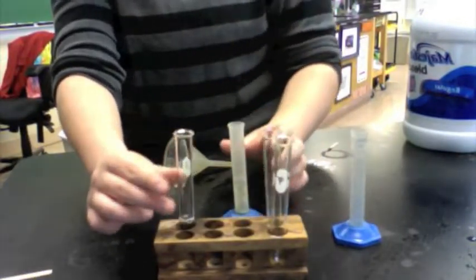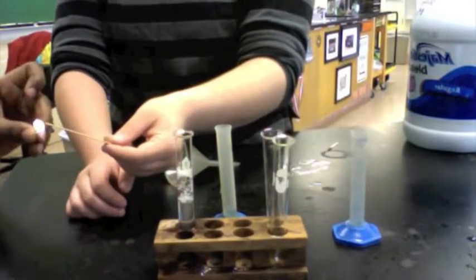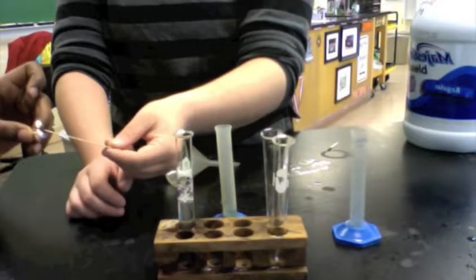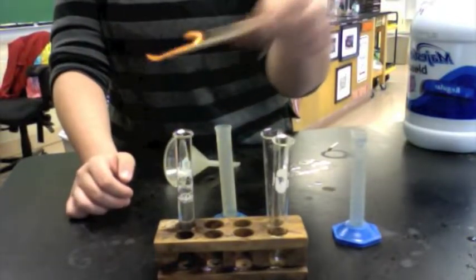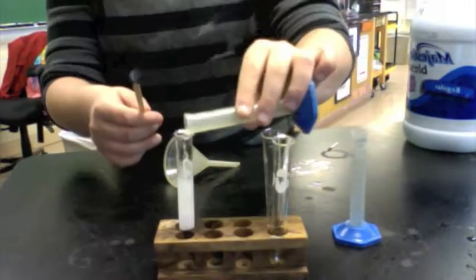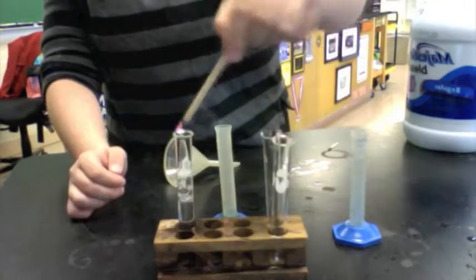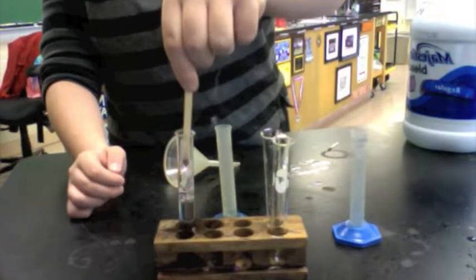Before you pour the bleach in, you will light the wooden splint. Once it's fully lit, put it out a little bit but make sure the tip is still glowing. After that, you can pour the bleach into the test tube. If the splint starts to light again, that means you have produced oxygen.